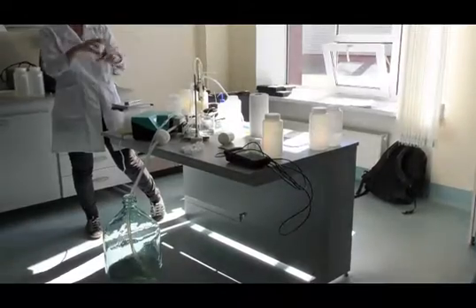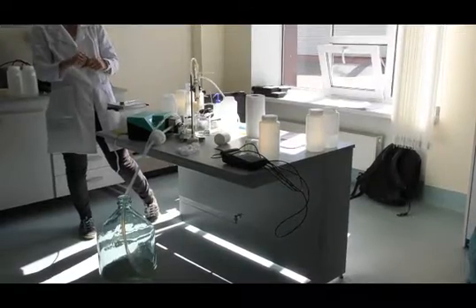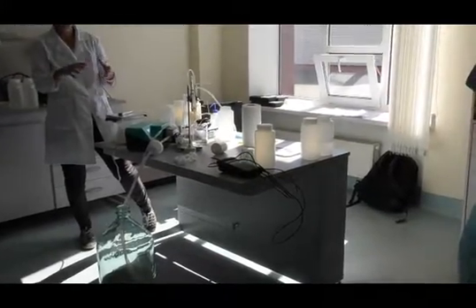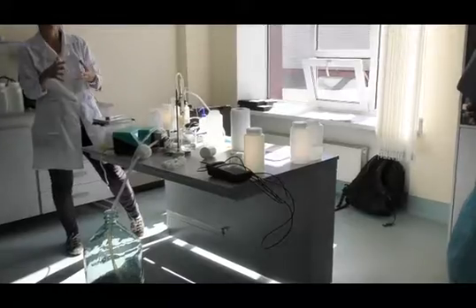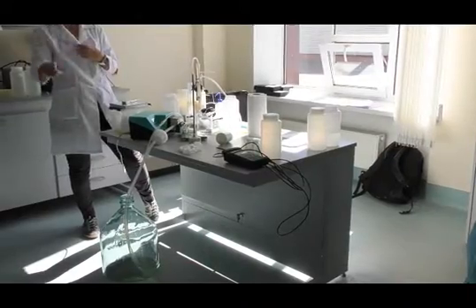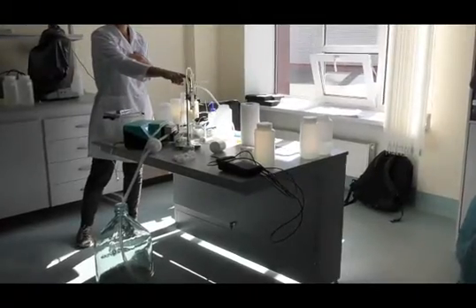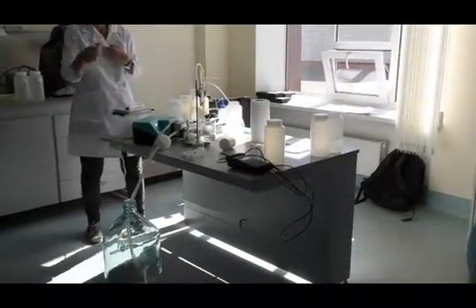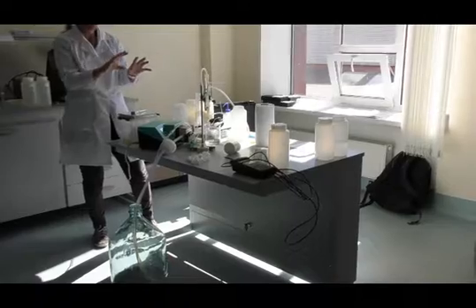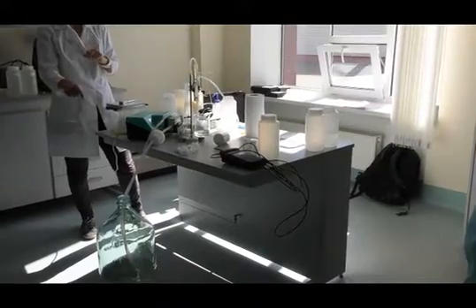We also need to measure pH and conductivity and take out the sample for total organic carbon before we do this. And then we take the 0.45 sample. If we don't do that, we will destroy the other samples, because we will change the sample in the bottle when we put it on recirculation. We remove some of the sample in the ultrafilter, and at the same time we up-concentrate this one. So make sure, if you are doing this kind of ultrafiltration, to do all the other sampling first.